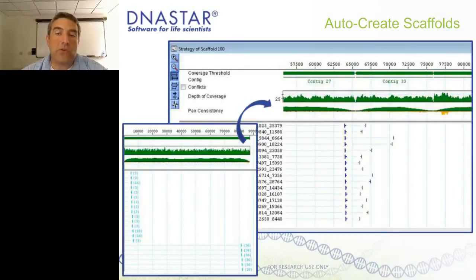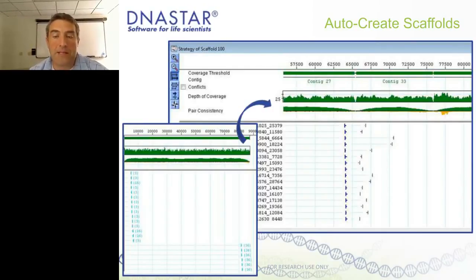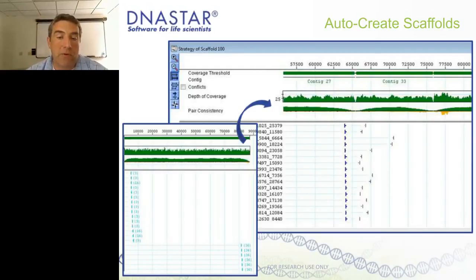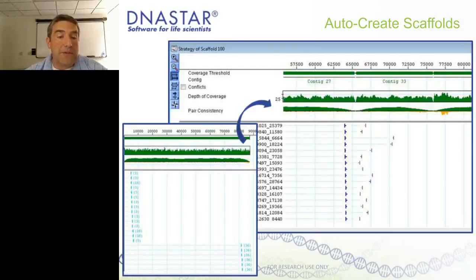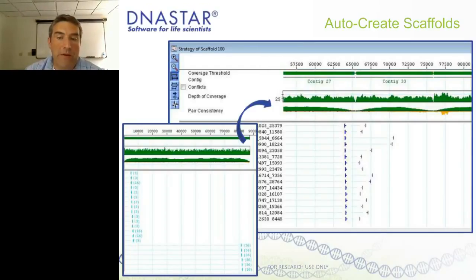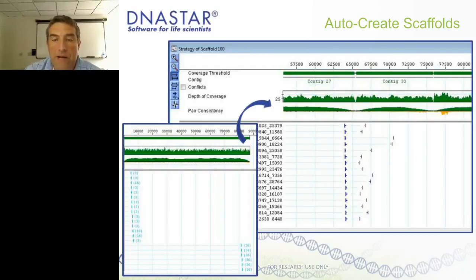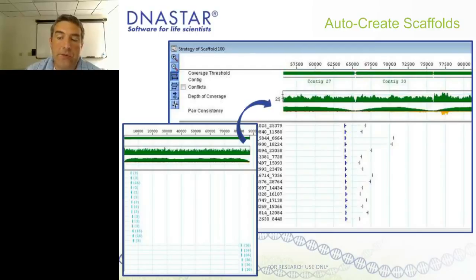Once I've cleaned up the contigs, I can create scaffolds. Our software does this in two steps: the assembly, then scaffold creation. Once I'm satisfied I have the most accurate possible contigs, our algorithm reads the mate pair data on the ends of the contigs and builds scaffolds from that information. The light blue numbers at the contig ends show which upstream contig the mate pair resides in. This results in things like contig 27 being placed next to contig 33, and we can visualize all of this to confirm everything is put together properly.